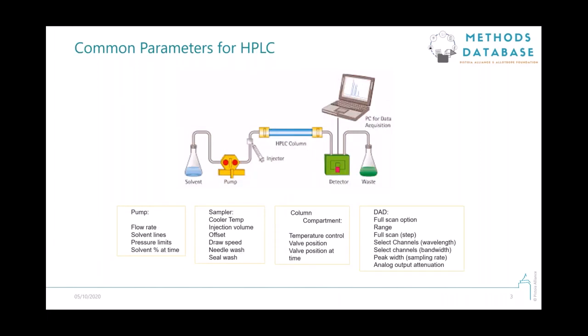So as part of that work, we have identified some parameters that are common across HPLC instruments and software systems from various vendors. And we have worked with Allotrope to define an ontology and data model to represent these parameters. And this data model has recently been released by Allotrope and has reached recommendation status.